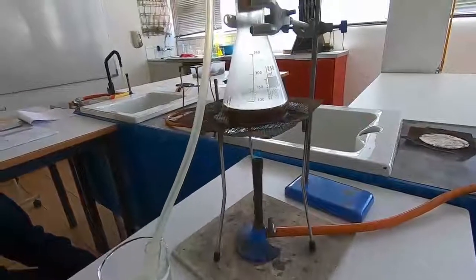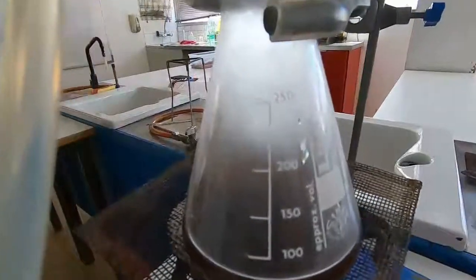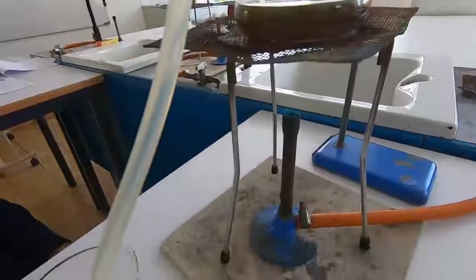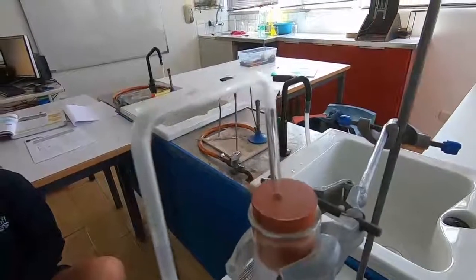We've lit the Bunsen burner and it's a blue flame and we're going to heat it up. You can already see some condensation in the conical flask, and as the vapours pass through the tube there, you can see some vapours passing through the tube.